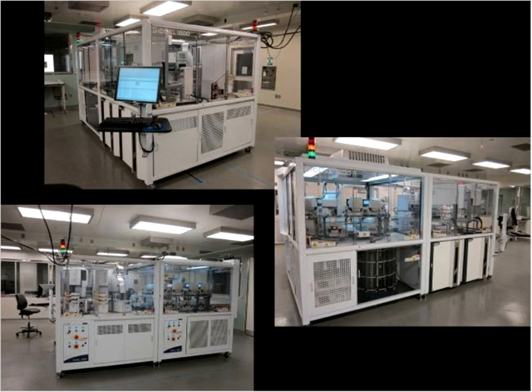One question that people might have is why we chose to go with Sanger sequencing technology as opposed to next generation or third generation sequencing. And the primary reason for that is because of the type of applications that we're envisioning for this system, that we needed to have the high quality data that you get from Sanger sequencing, and which really hasn't been achieved yet from next generation sequencing. That being said, there are other types of applications, obviously, in infectious disease work where next generation sequencing is proving incredibly powerful, and we're also working with our infectious disease community to set up a pathway to allow for samples to be prepped within this facility, and once they're no longer infectious, then shipped out to external facilities for next generation sequencing.